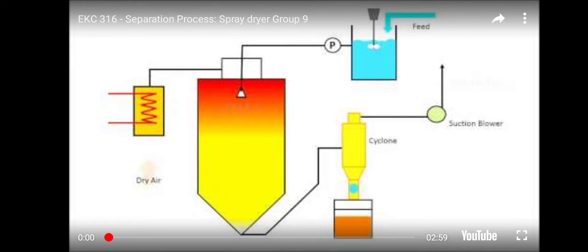This is a sample video which demonstrates the operating principle of the spray dryer as shown.